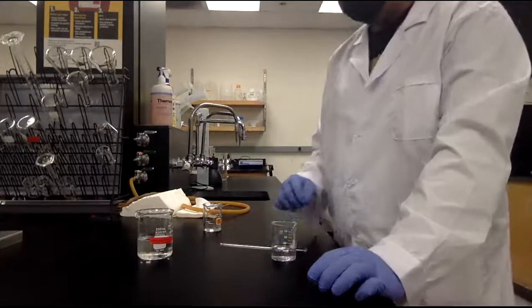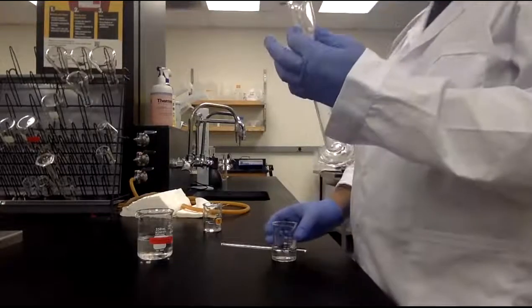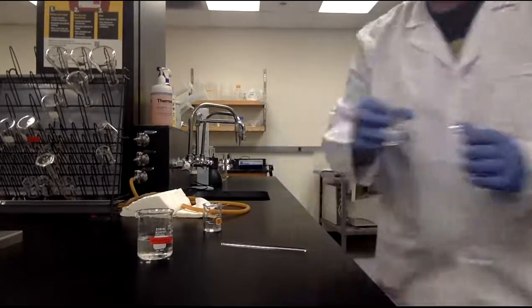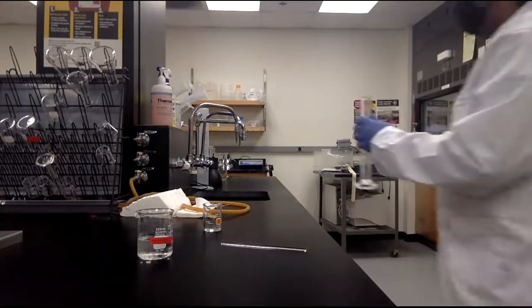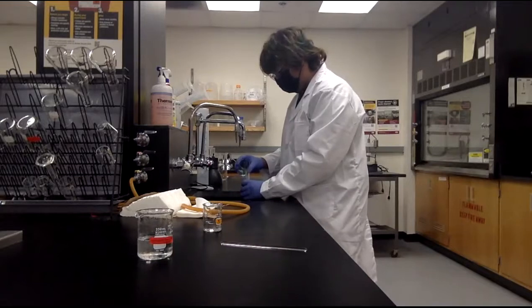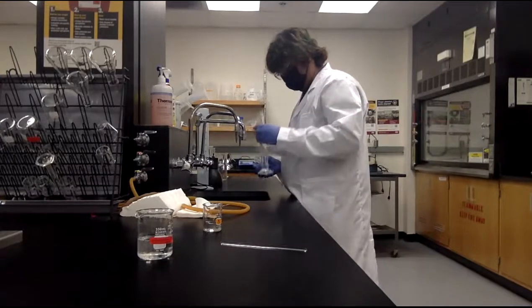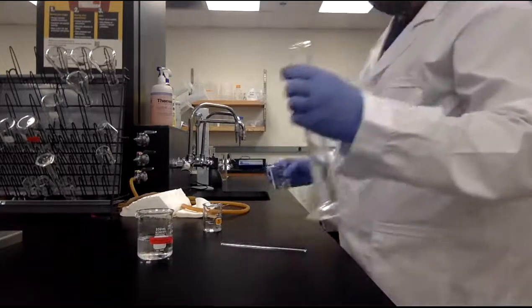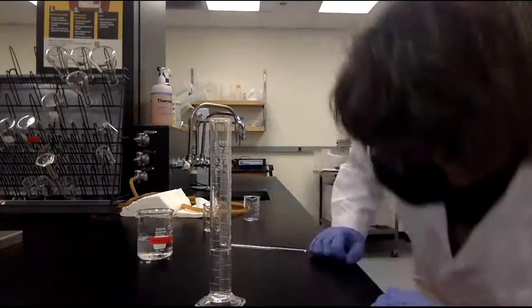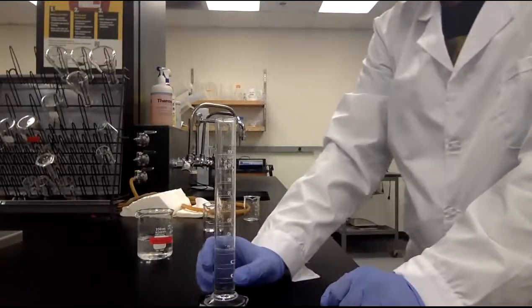Okay. So we need to, let's grab a graduated cylinder over there. This guy. Pour it into the graduated cylinder. You can do it here. I'll do it with this. Okay, so what's the volume now? That is about 33 milliliters. Now you bring the volume to 50.